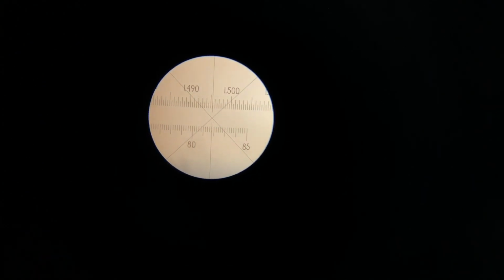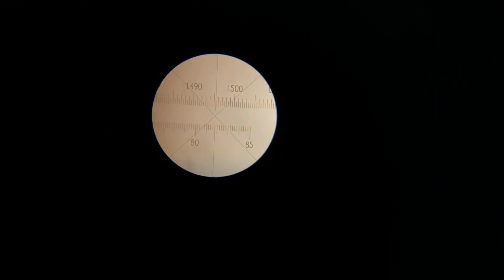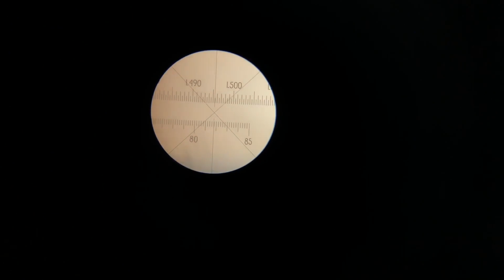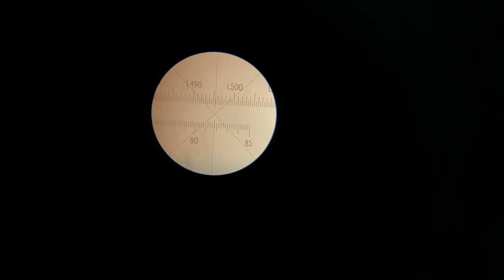So in between that is 1.4955, but it's just slightly shy of that smaller line between 1.495 and 1.496. So we're going to say that this is 1.4954.